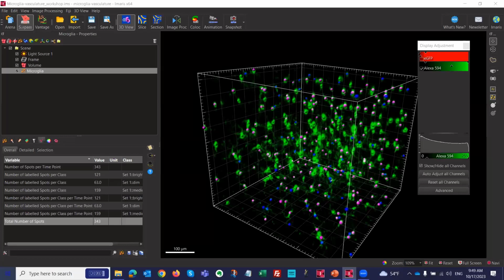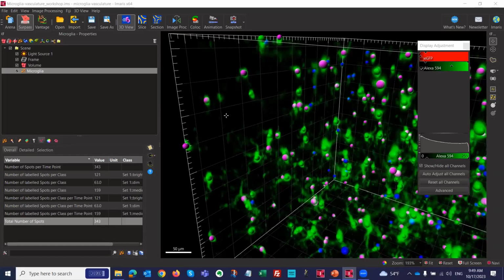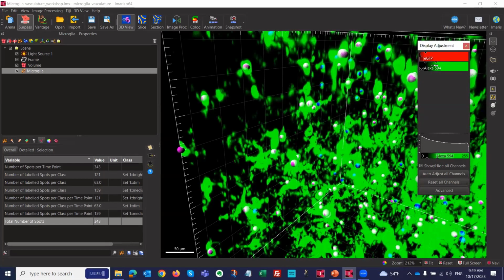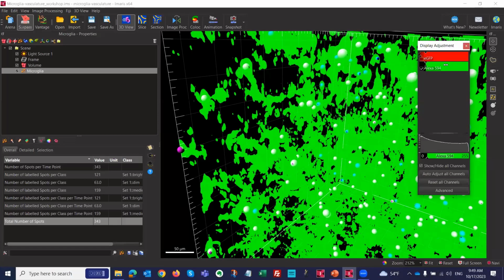To see the dim cells, sometimes cells that look separate when the image is dim look connected when you brighten it. You mean like if you do this, those are connected, and this will not capture those. Yes, you can keep some of them and treat them separately.